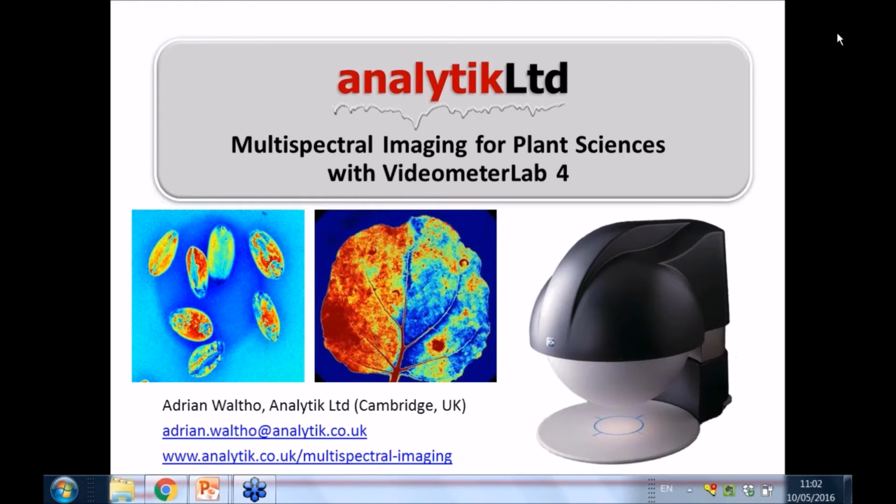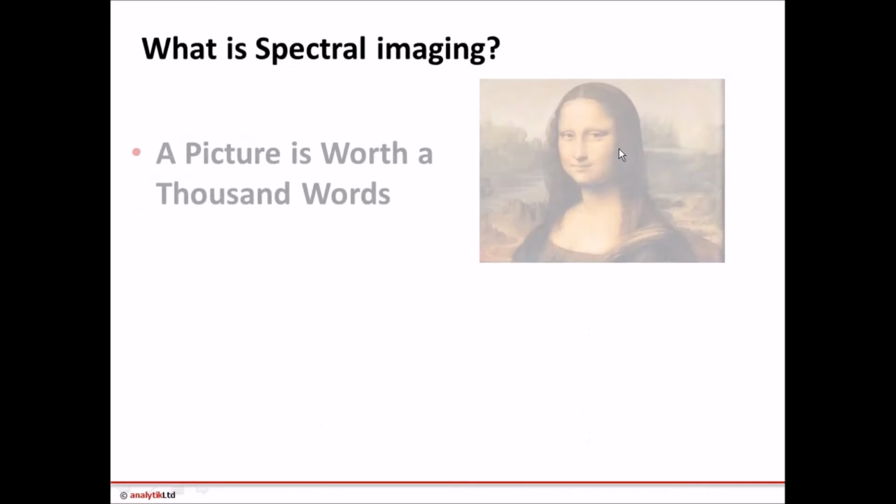Then I'll move on to a bit about multispectral imaging versus hyperspectral. Talk a little bit more about the VideometerLab that you can see here and some of the applications we've developed with that, specifically in plant sciences, and I'll show you a few kind of cool things. So if we start the presentation.